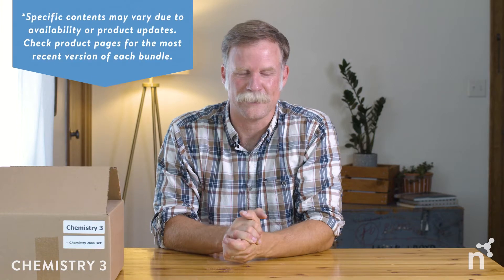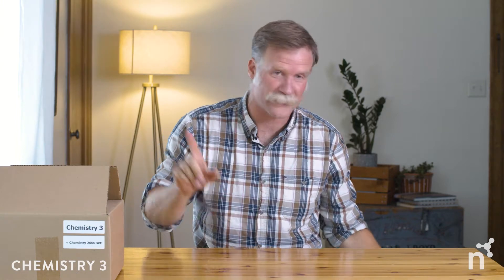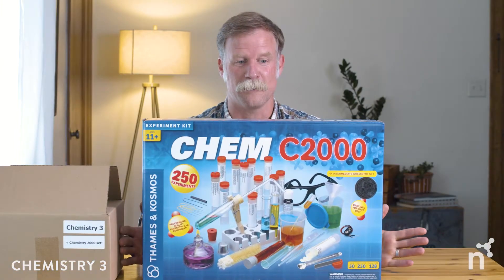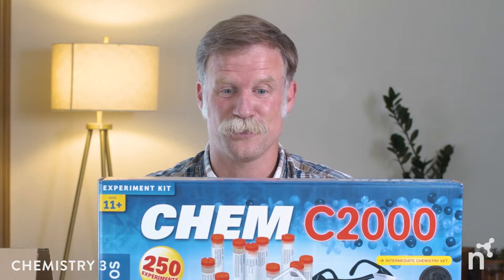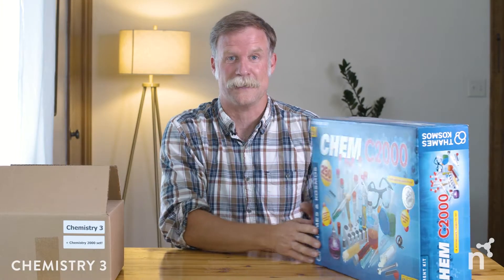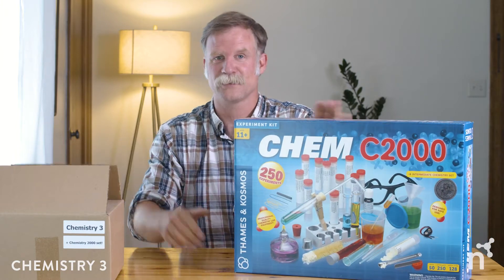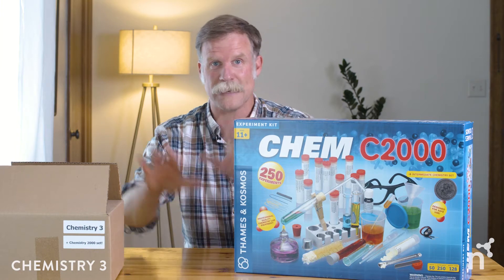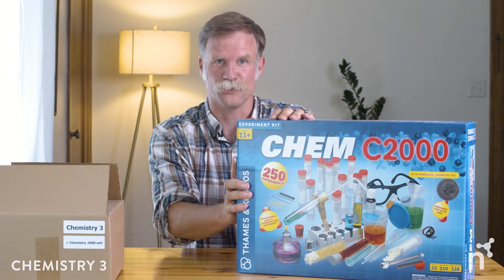Let's take a look at what we have inside and I'm going to mix it up a little bit this time. If you've been watching any of the other videos, you know about the instructor's guide — we'll get there. Let's start with the big and glamorous stuff: the Chem C2000 chemistry set. This really is a class for seventh and eighth graders. They're ready to set up their own chem lab at home, so create the space and this will do a lot of the work for you.